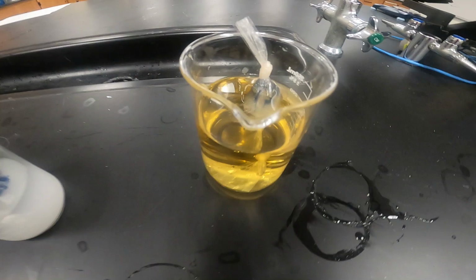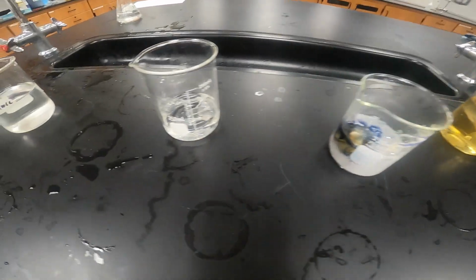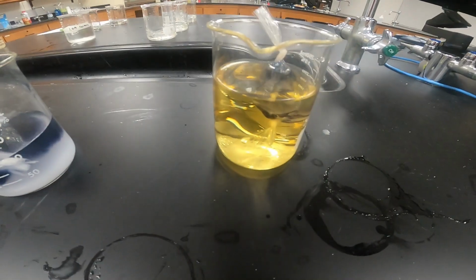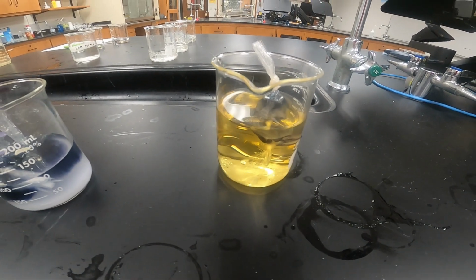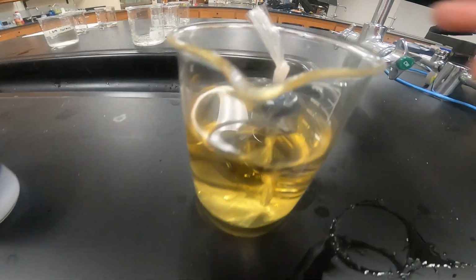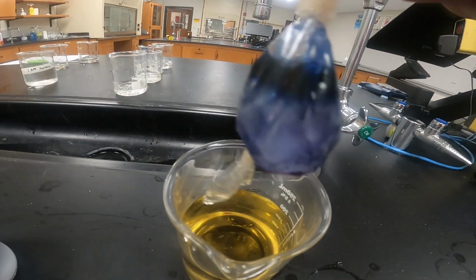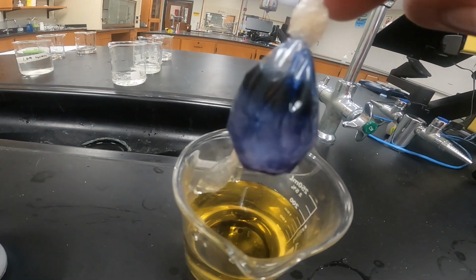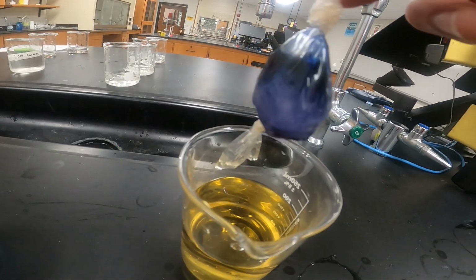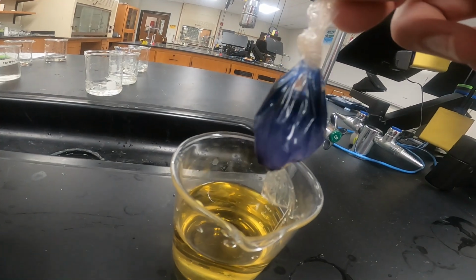And these balloons still have 10 to 15 minutes left, depending on which one we're looking at. So now it's been about 20 minutes since we placed our dialysis balloon in. We can see our beaker solution is still a golden yellow color. And if we pull our balloon out, you can see it's a purplish color. That purplish color indicates that the iodine has moved into the bag. When it comes in contact with starch, it causes this purple color we see here.